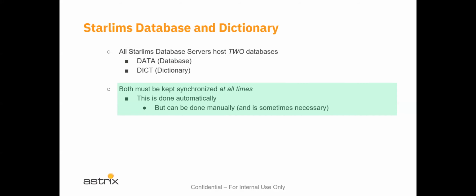So essentially what happens is by use of the designer, you are sheltered or kept away from the actual complexity of the database functionality required to do those things. So you can add a table, and you can modify a field, or add a field, delete a field, whatever it might be. You'll learn how to do that within the STARLIMS environment, which provides you a nice UI and provides feedback and immediate responses on the screen to indicate that something either worked or didn't work, as it were. You can all do that within the designer. So it shelters you and removes you from having to do it in the database.